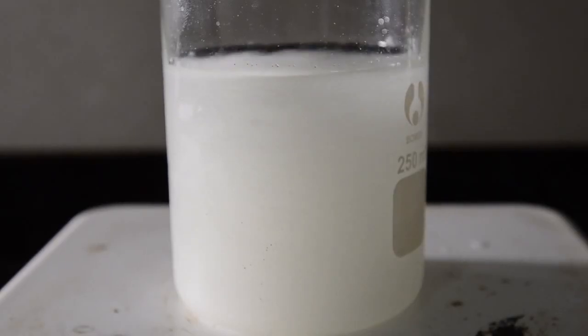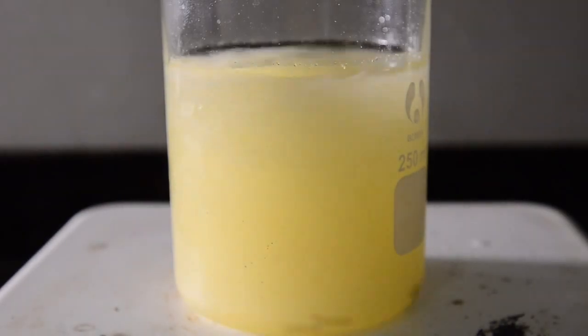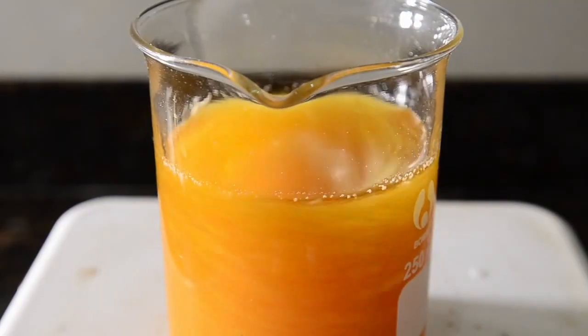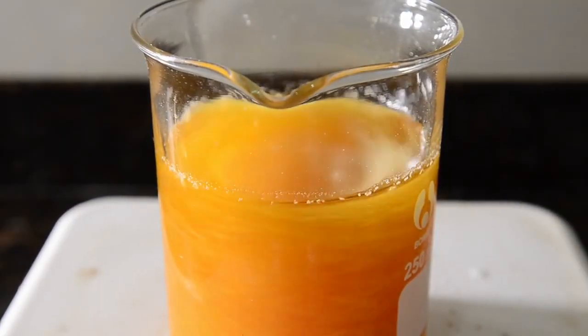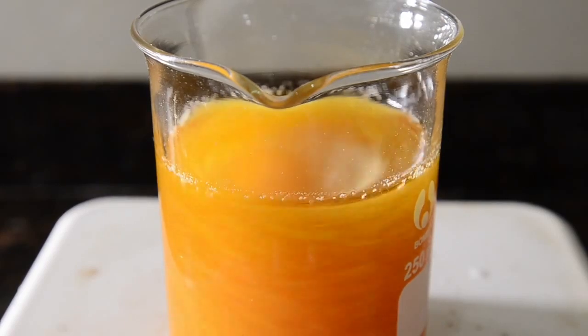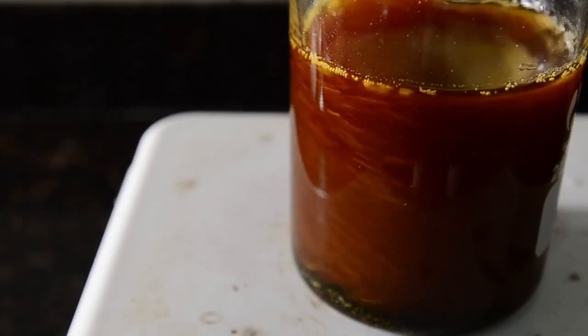Now add the iodine to the suspension, one portion at a time. You should immediately see a yellow color as some of the iodine dissolves in the potassium iodide solution to form the I3- ion, which is the reactive species. Keep adding the iodine, and the color will change to orange, and the vanillin in suspension will appear yellow in color. Not all the iodine will dissolve immediately.